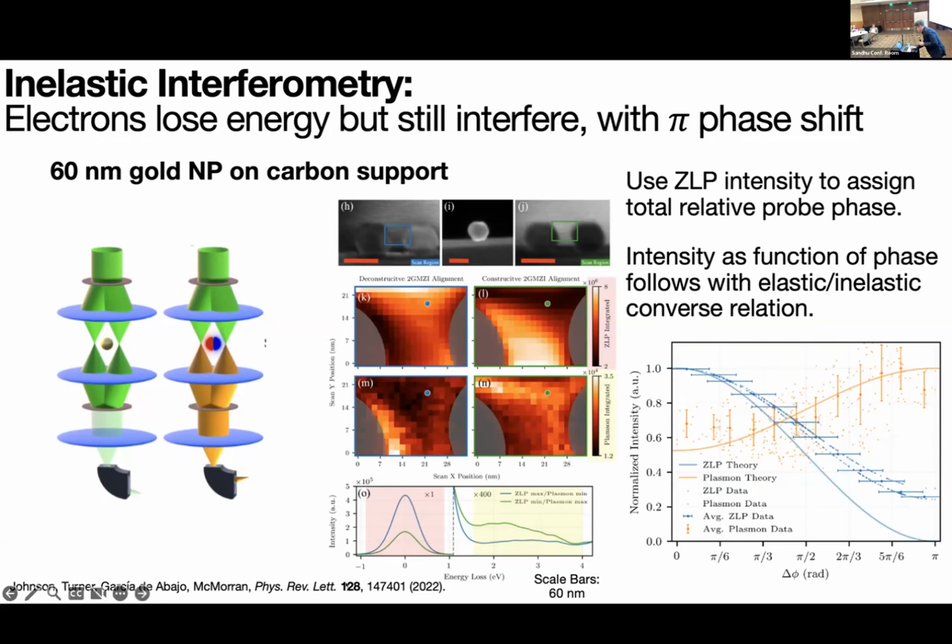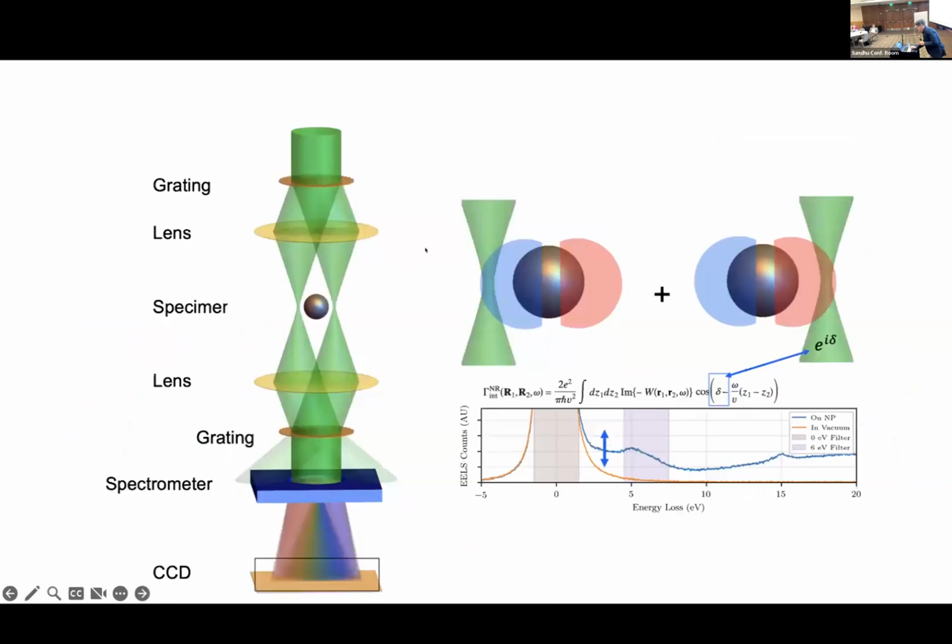The answer to this is that we've excited the same mode. So you can imagine that this plasma, this sloshing electron plasma back and forth this way, eventually it will decay and release a photon, but that photon is going to be linearly polarized in this direction. And the photon can say which polarization it's in and what energy it has, and that's it.